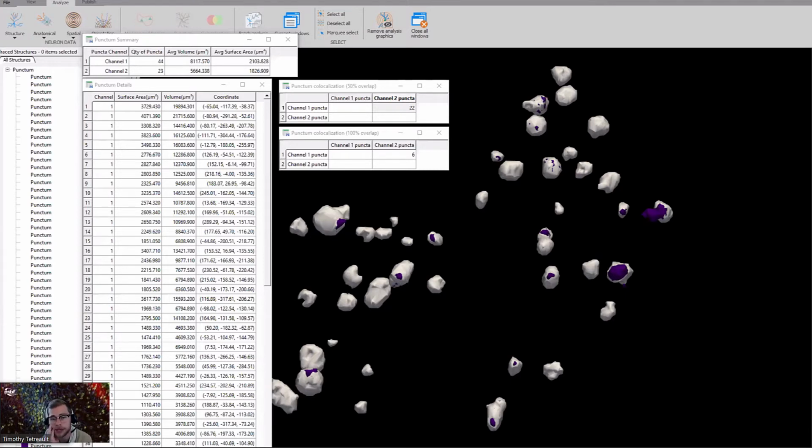And the difference between this and the contour feature, it's a lot less manual. If you're drawing contours around things, we're not going to really be able to generate those volume and distance measurements as much as we are here. It's going to result in you doing a lot more manual labor as opposed to having the program run through and do those detections for you.